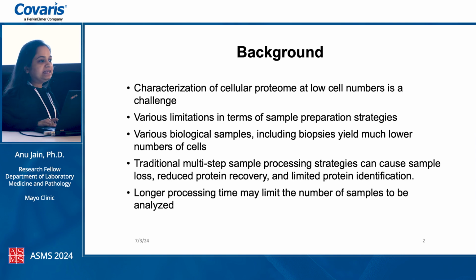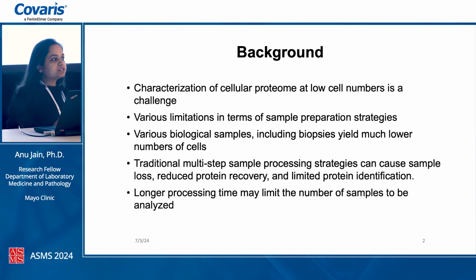However, as easy as it sounds, it is quite challenging and difficult, especially in terms of sample preparation strategies. So when we start with low starting material, the multi-step sample processing workflow that we generally use for preparation of sample for proteomic analysis can cause sample loss, leading to reduced protein recovery and limited protein identification.